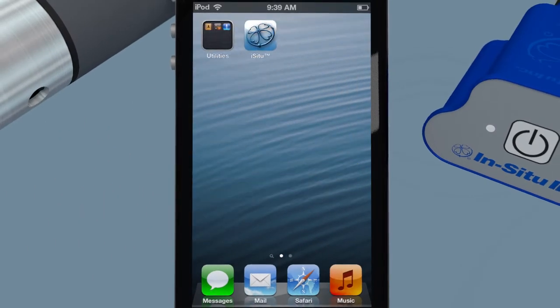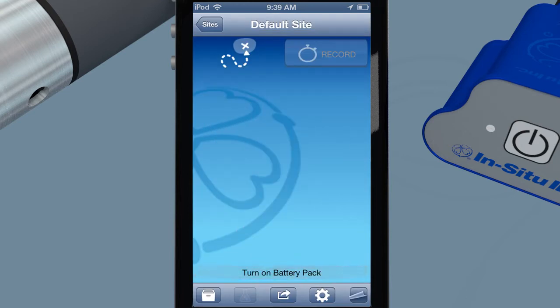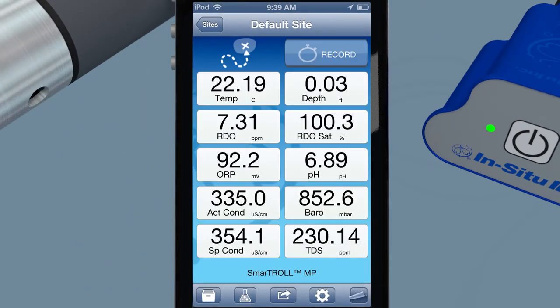Bluetooth communication between the handheld and your smartphone provides a secure wireless data stream. You can purchase the iSitu app easily using the iTunes store. Push a single button and LED lights on the battery pack indicate whether you have made a connection to the app via Bluetooth.